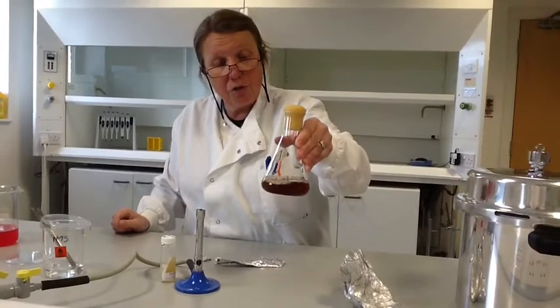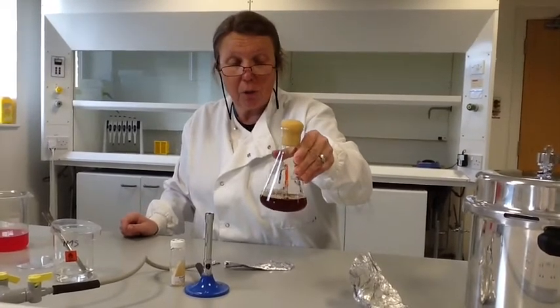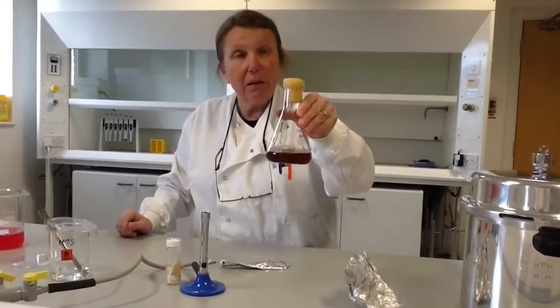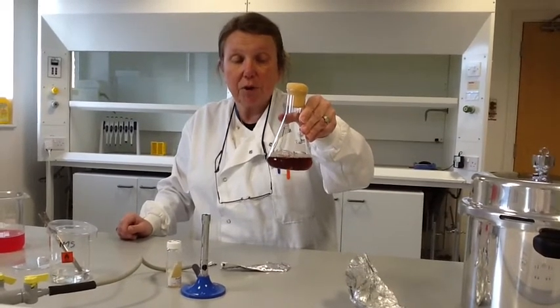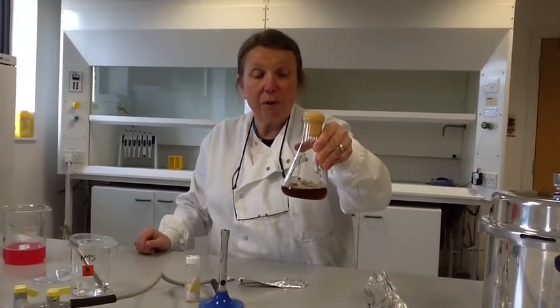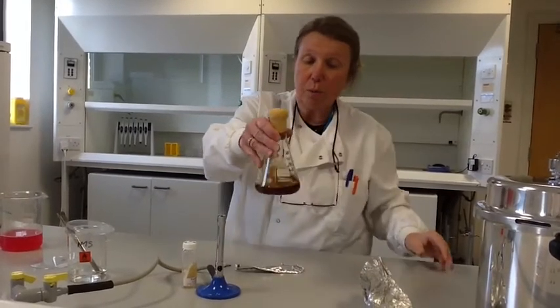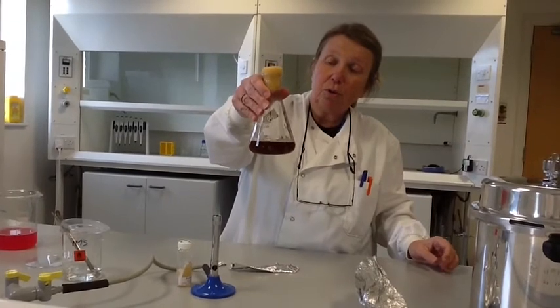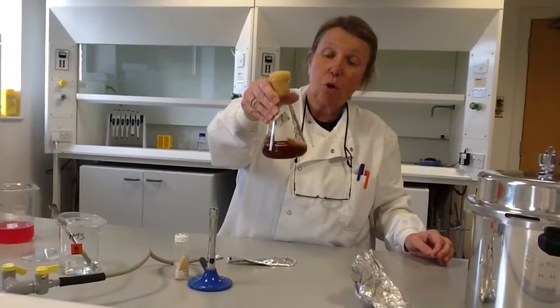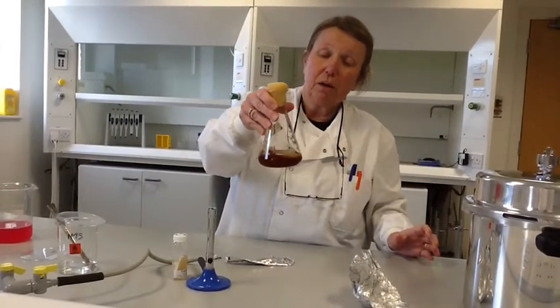Fungi are generally strictly aerobic, so they need lots of air in order to grow. If you have a shaker or stirrer that you can put your culture on, so much the better, as that will incorporate air as they grow. They ideally like to be incubated at about 25 or 30 degrees, but if you haven't got an incubator you can put this on the bench and they will grow well, just taking a little bit longer. If we haven't got a shaker, each day we come in two or three times and give the flask a good shake, incorporating air — making sure we don't make the foam bung wet — to help the fungus grow.